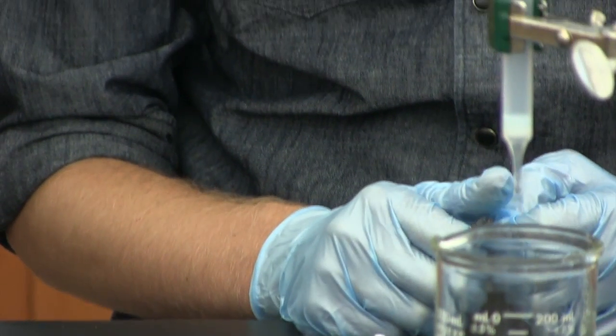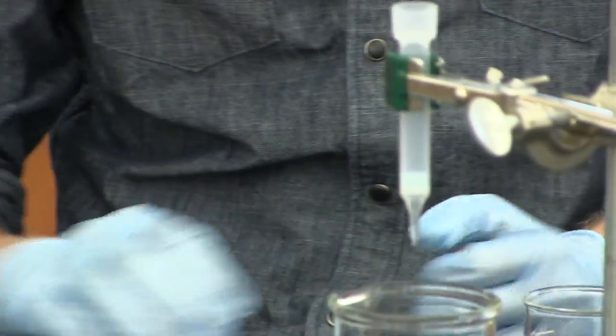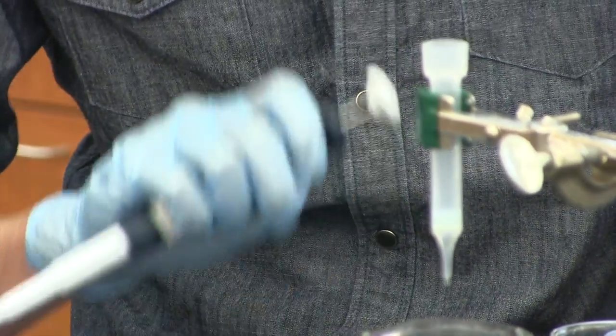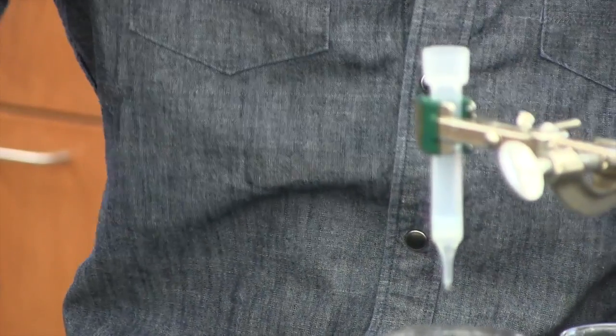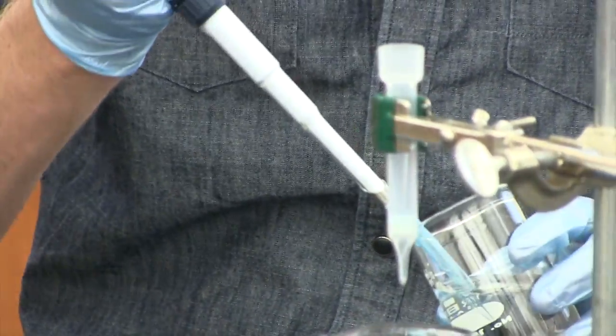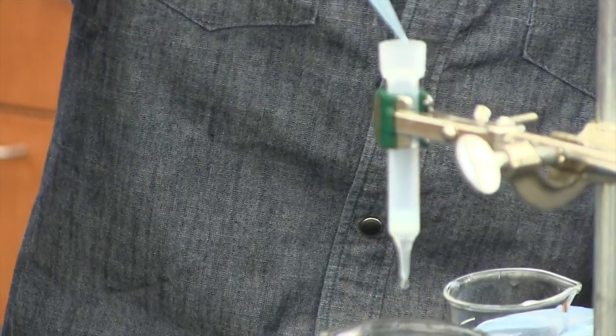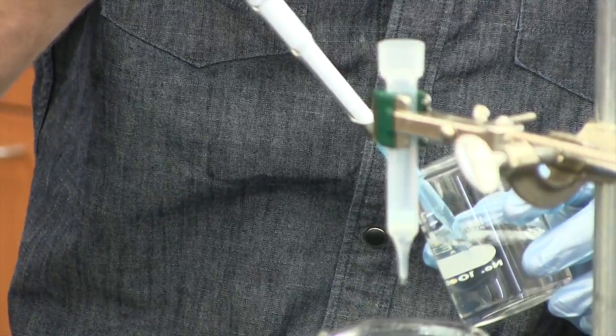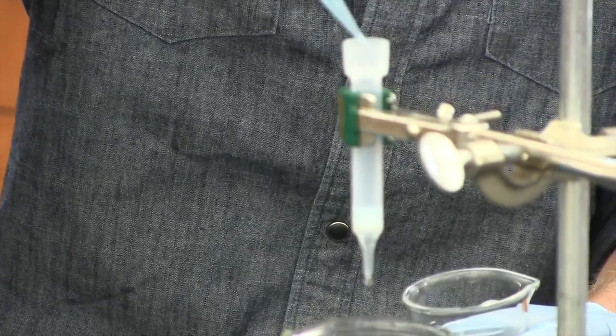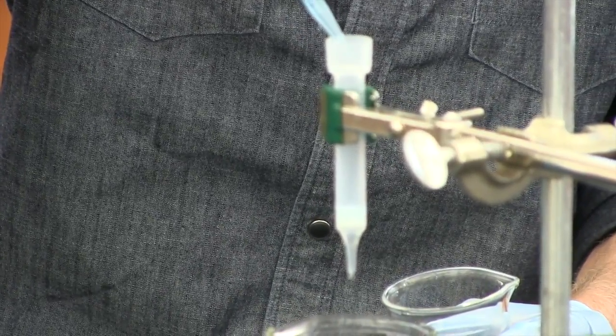With a pipette, gently add more buffer to the top as it's running. We want to fill it up again to the top so that we can put the glass wool on top and soak up the buffer just like we did with the frit. You need to be careful when you're putting buffer in that you don't mix up the resin that we just settled in the bottom.